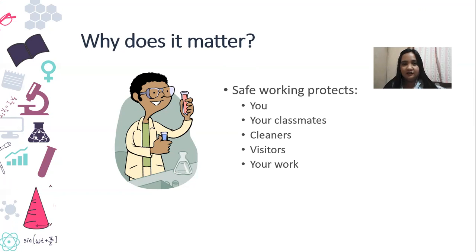The next, you are going to safety because you want to protect your classmates. Of course, you cannot survive a laboratory class without your classmates. So if you're trying to make yourself safe, your classmates as well. Not only you go in and out of the labs, of course, we have our cleaners. Those will be those in charge of maintaining the cleanliness of the laboratory. We also have our lab custodian, and we also have what they call your student assistants. So you also have to make it safe for them.